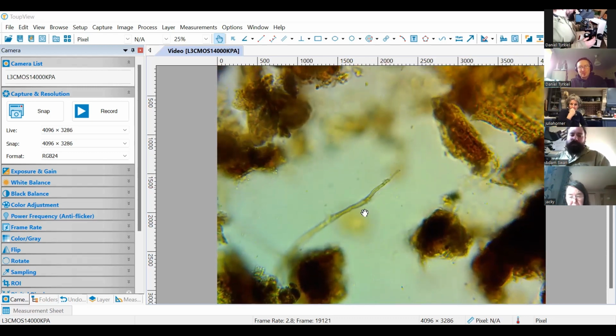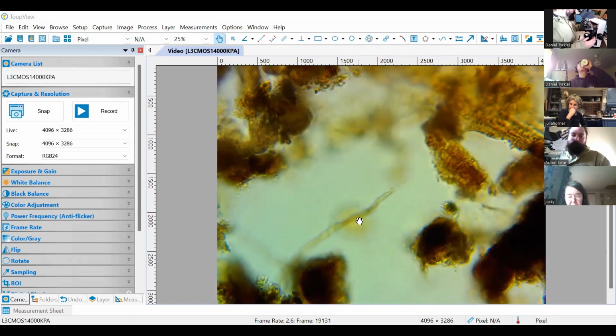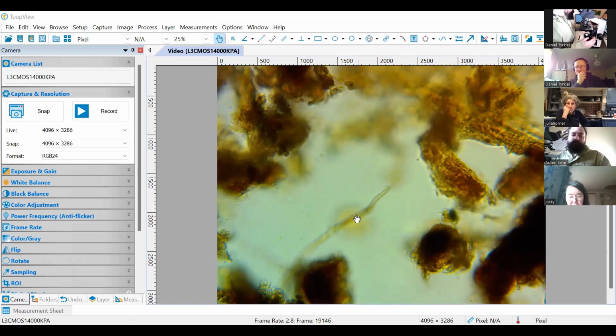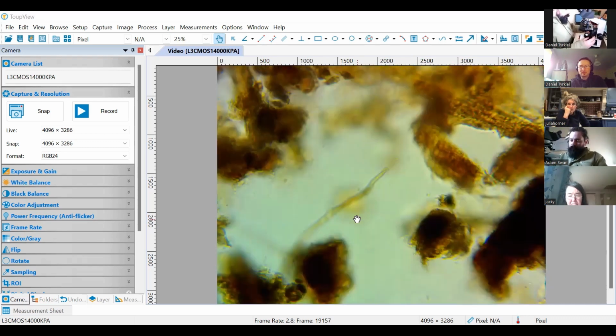You will see little indentations in the diameter, which will change the overall diameter. That's just where the hyphae was growing around something in the environment. Sample's now drying out, so I'll switch to a different sample.